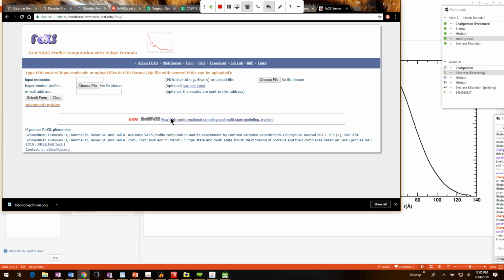So there's two ways of doing this. You can definitely do the SEC-SAXS. That's a good way of going. I mean, that's the best way of going. You probably, in your high throughput, found the condition or construct that was most monomeric and the condition and construct that was most dimeric or larger. So those you would use to decide what condition and construct to send for SEC-SAXS.